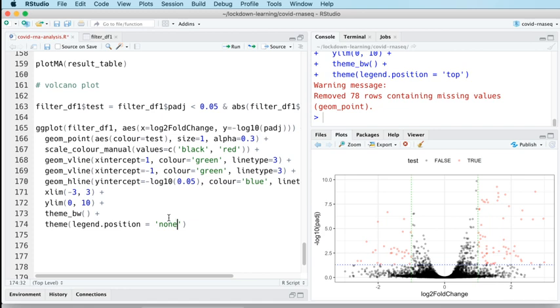Google really is your friend here. If you want to change the way a ggplot plot looks, that information is almost certainly out there already. Somebody else asked about putting gene names on the points. You can do that. Obviously, when you've got 15,000 genes like that, you would have to do it conditionally, so that only some of them have names on.